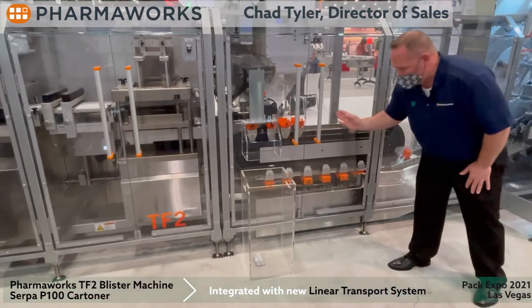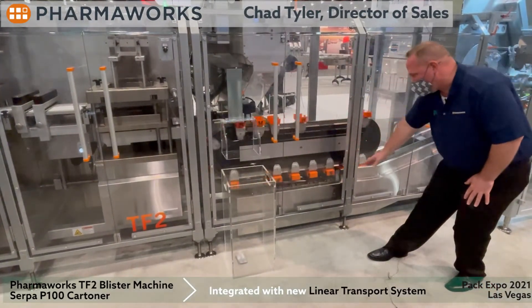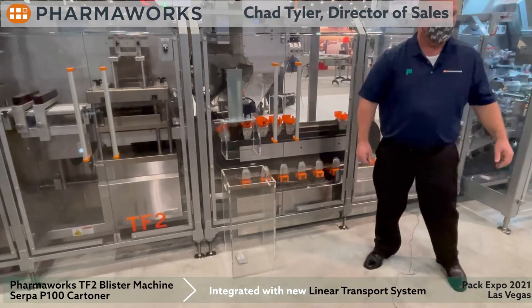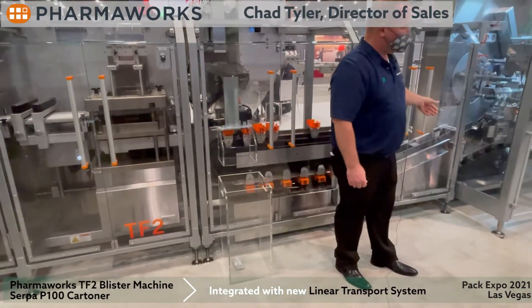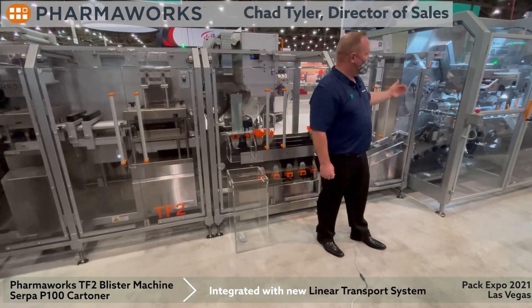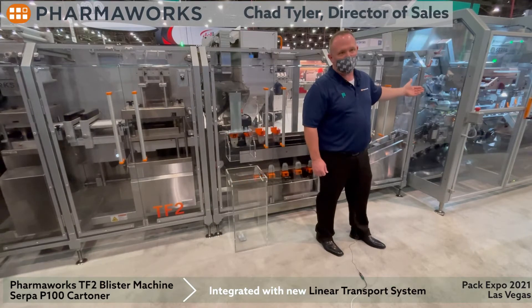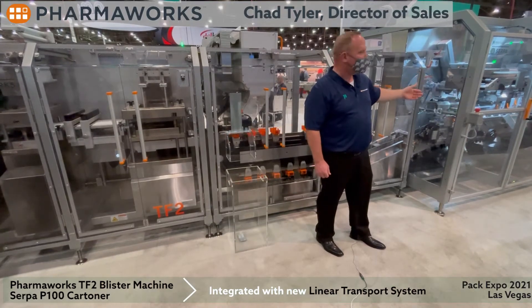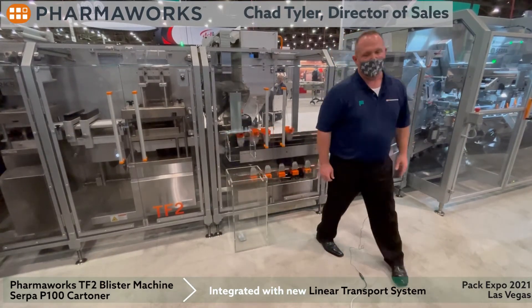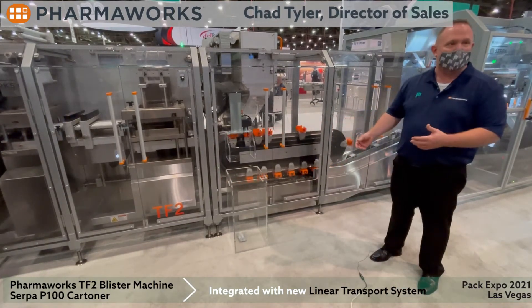We're now in sync with what's called the Kartner bucket conveyor. The XTS comes around with the blisters in it, syncs up with the bucket conveyor of the Kartner, and places the blister in. Once the blister is in, the carton machine has intelligence built in — it sees that there's a blister in the bucket, puts down a carton. You can have a leaflet, then you either glue or tuck the cartons. You can print on the cartons, inspect it, and then reject it. So what we're going to do is run a few of these for you so you can actually see it in action.